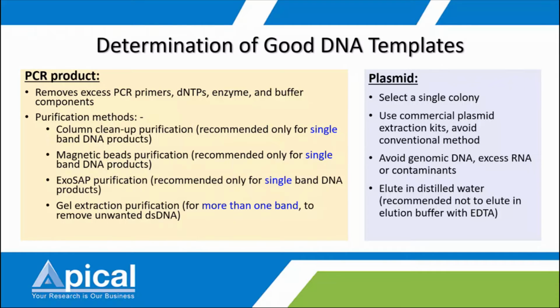But sometimes you may get a very close band, and then it may be difficult to perform gel extraction purification. There are cases like this.